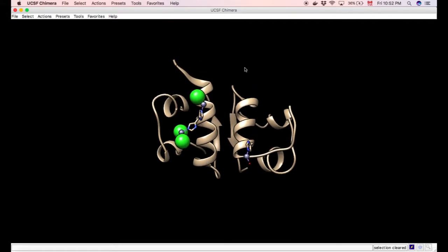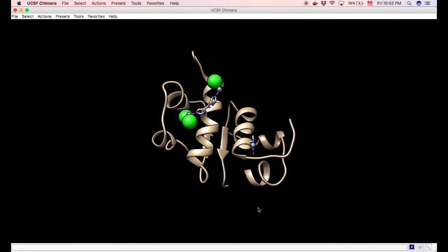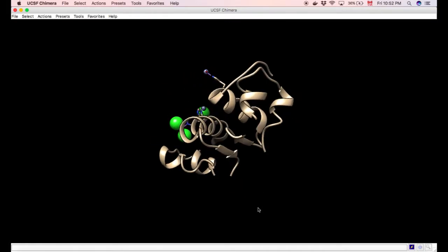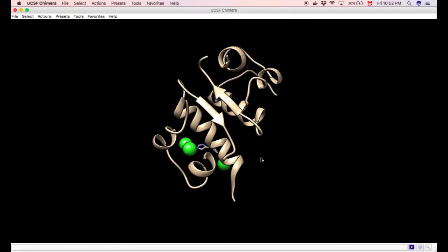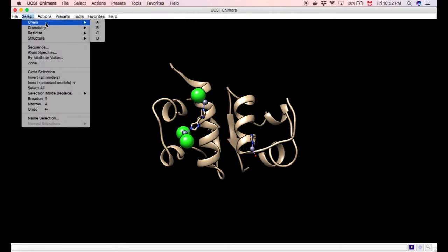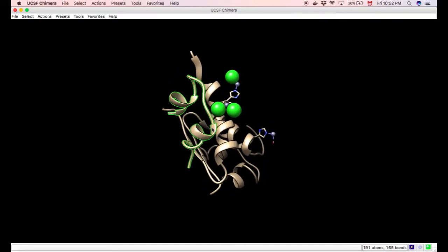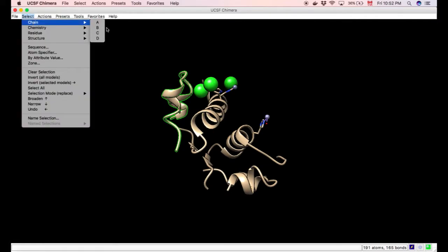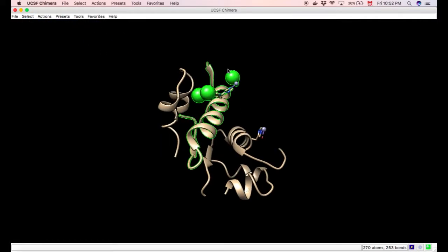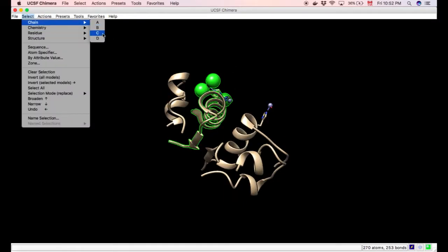So we have those 2 insulins that are actually broken in 2, right? That's very interesting. I wonder if this is part of the rest of the insulin or something else, whatever. Once this is done, you can select by chain, so A. Okay, in the PDB, probably these are A, B, C, D. So selecting A, selecting B. We see that the ions are associated with some of the sequence, and it can go on to C and others. Okay.